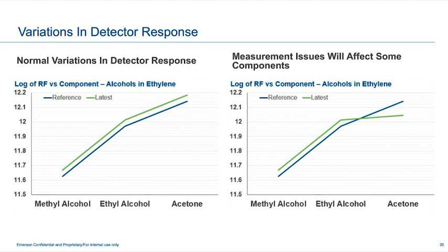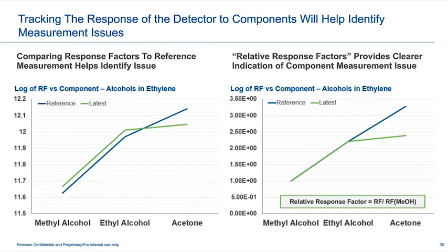And so in this particular case, this problem happened because of the time event. Basically, the inhibit is cutting off the peak of the acetone, so the full amount of area is not being calculated. And that will cause the response factor to decrease. So if we did the relative response factor plot, it's really dramatic.